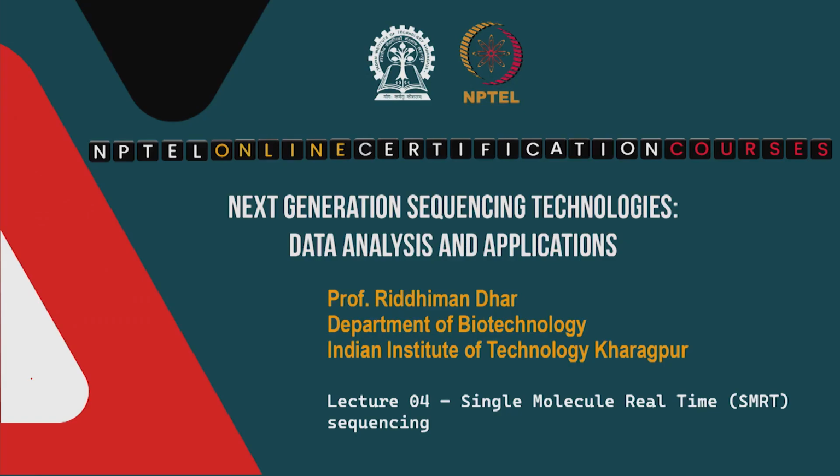In the last few classes, we have been discussing different next generation sequencing technologies such as 454 sequencing and Illumina. So, today we will be discussing one more technology, called single molecule real time sequencing, or in short SMRT sequencing, and we will see how this method is different compared to the last two that we have discussed so far. So, let us begin.